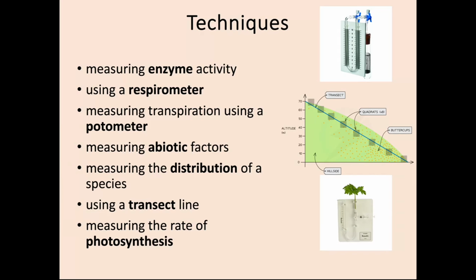Sometimes a respirometer might look a bit different, and you've got the capillary tube going into some lime water or something to measure the carbon dioxide secreted by the organism. But this is a respirometer, okay? And as I say, they might look just slightly different from this one, but being familiar with them is useful for the exam in case they ask about it.